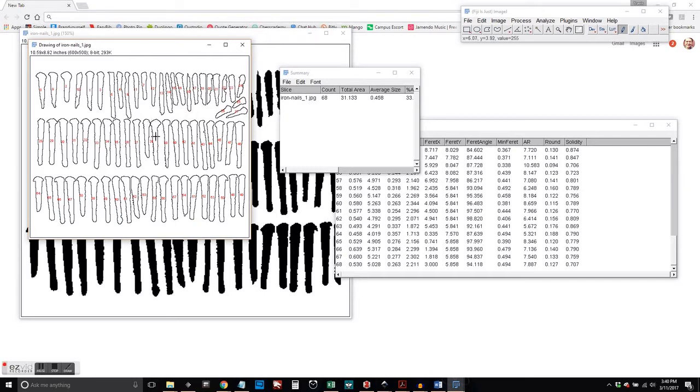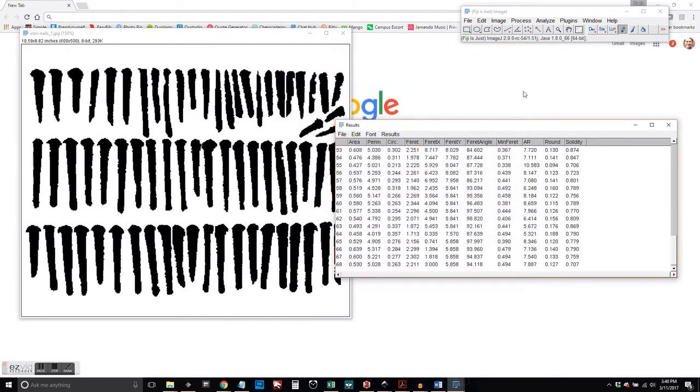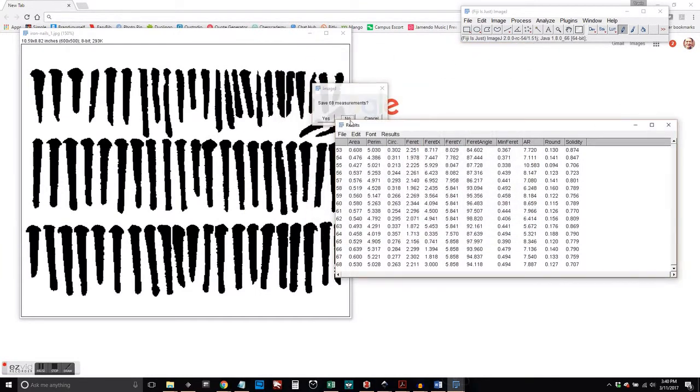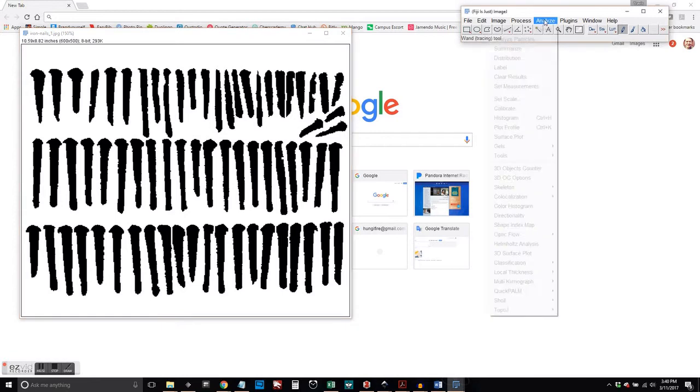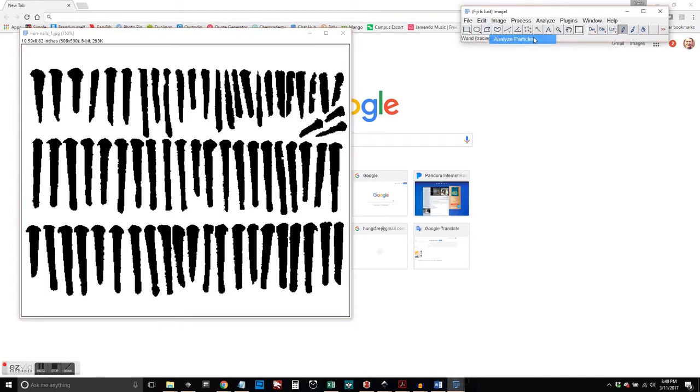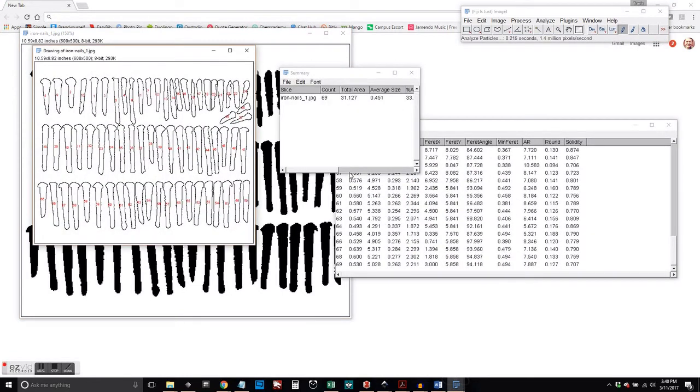You see how the number is in the middle of those two nails. That ImageJ thinks that's all one object. So I'm just going to go back and make sure to separate those. And then click on Analyze, Particle Analysis, and here we go.